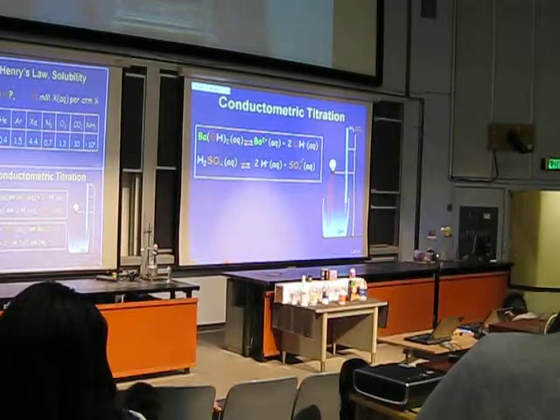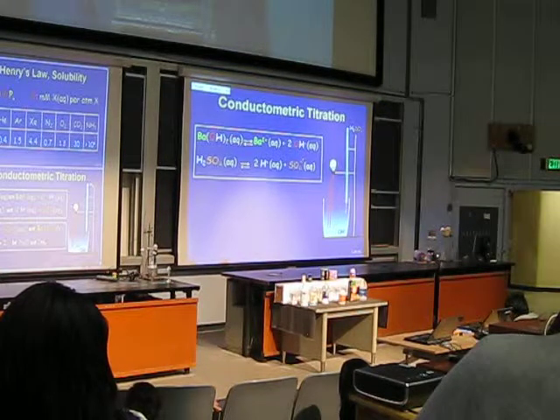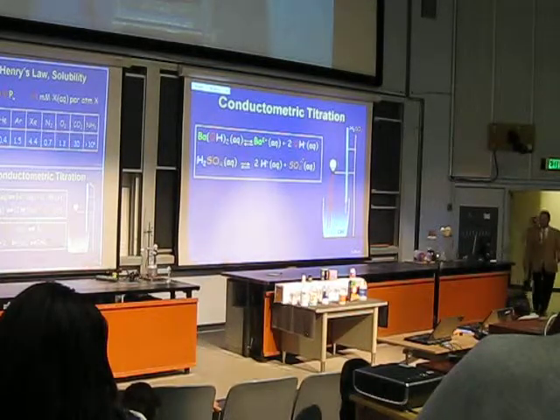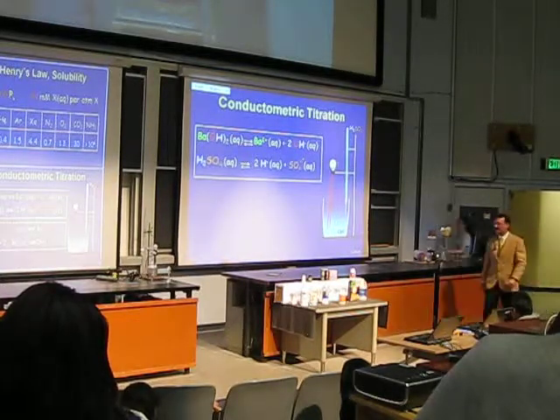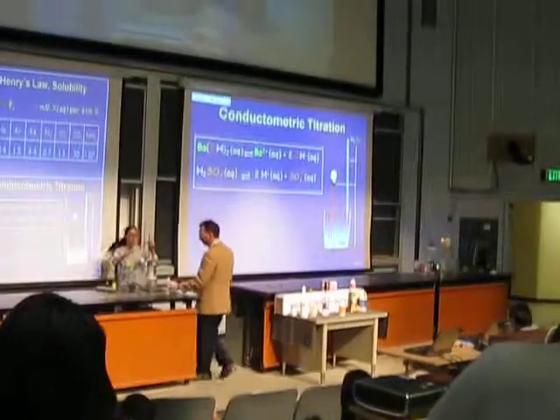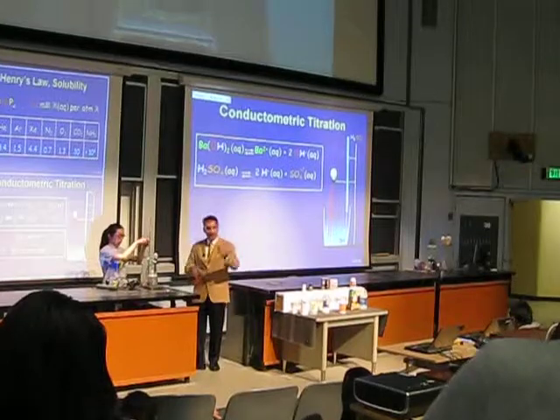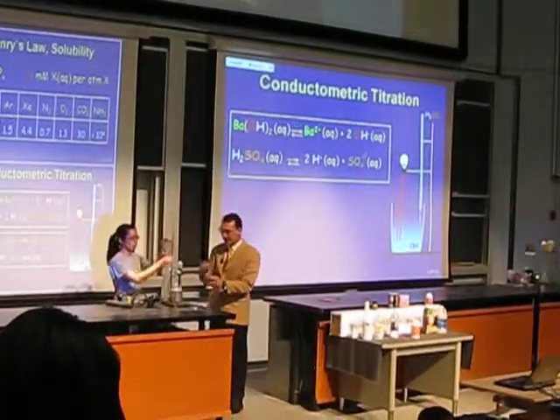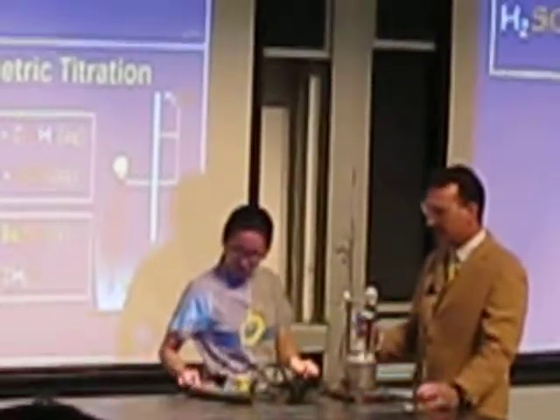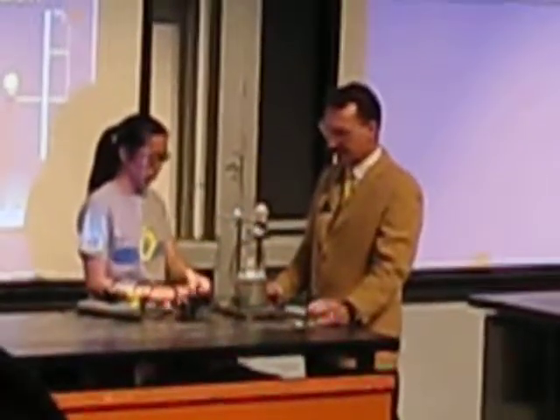Can I just add the barium hydroxide to the beaker and then start titrating? All right. No, but we can get that. So what I have here is barium hydroxide. I'll add this barium hydroxide to this solution. First we'll start the stir bar going.